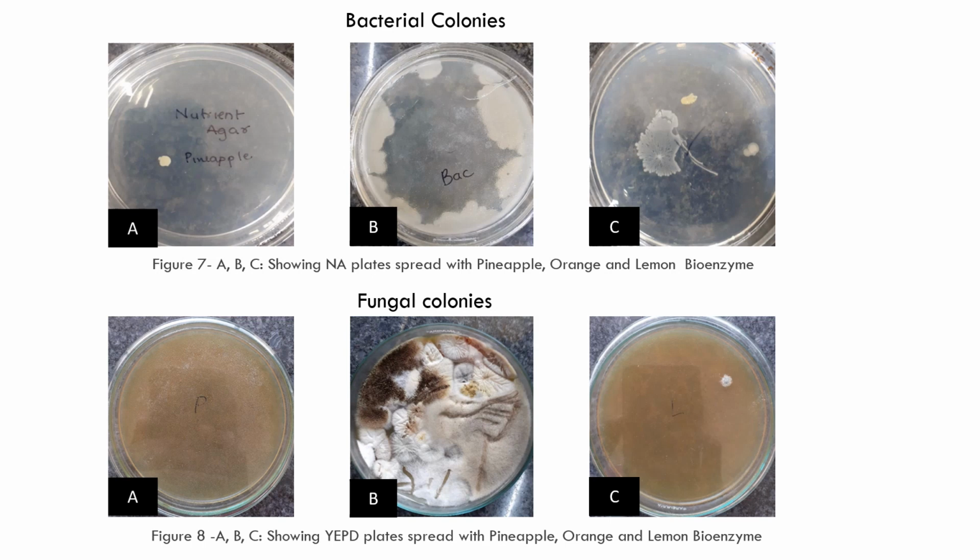In the testing for bacterial colonies, nutrient agar plates were taken and were spread with pineapple, orange and lemon bioenzymes. The agar plates were kept in incubation for 24 hours at 37 degrees Celsius. Here you can see that the orange bioenzyme plate is having a lot of bacterial colonies compared to pineapple and lemon bioenzyme plate. The fungal composition was carried out using YEPD media.